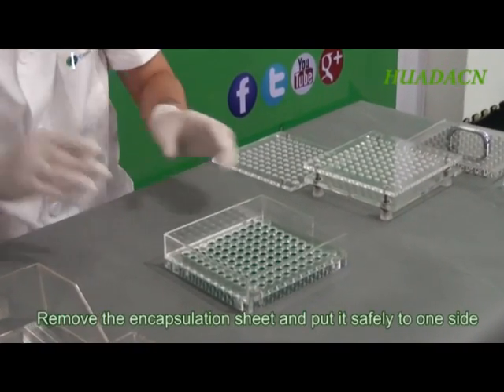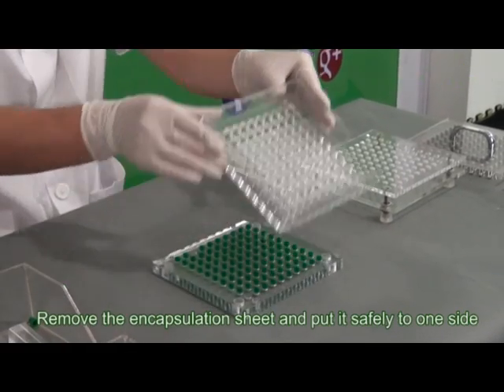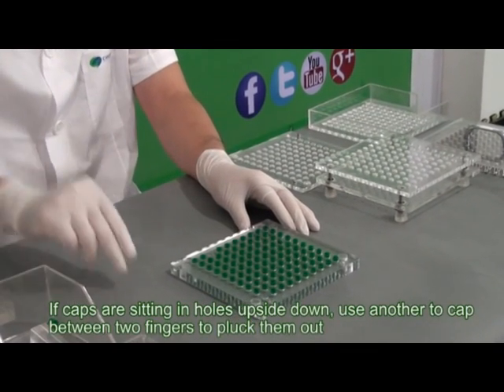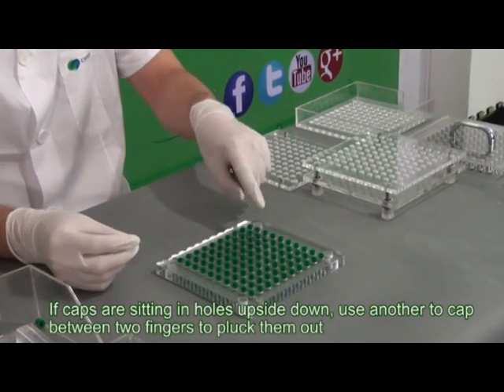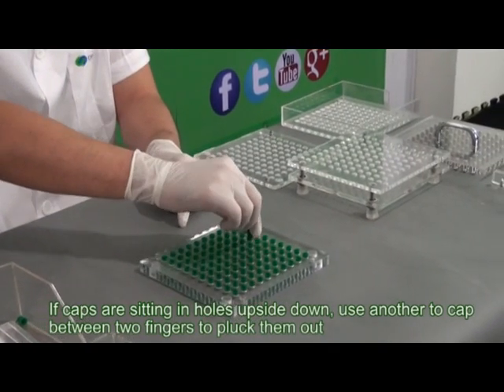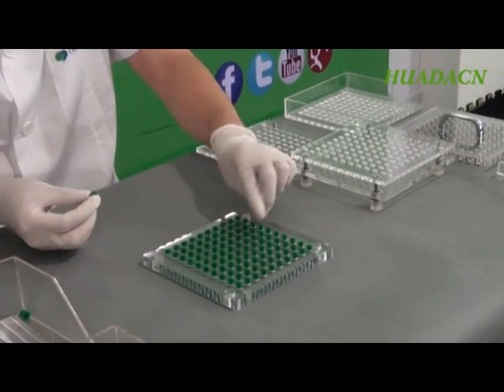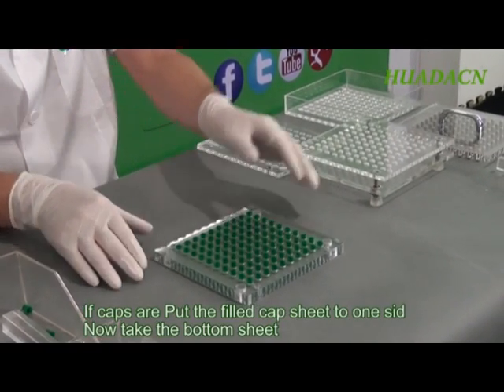Remove the encapsulation sheet and put safely to one side. If caps are sitting in holes upside down, use another cap between two fingers to pluck them out. Put the filled cap sheet to one side.